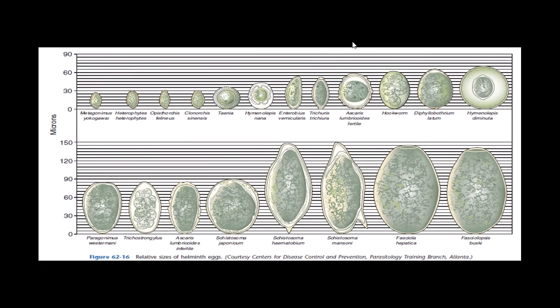This slide shows some of the relative sizes of ova or eggs compared to the different types of the parasites.